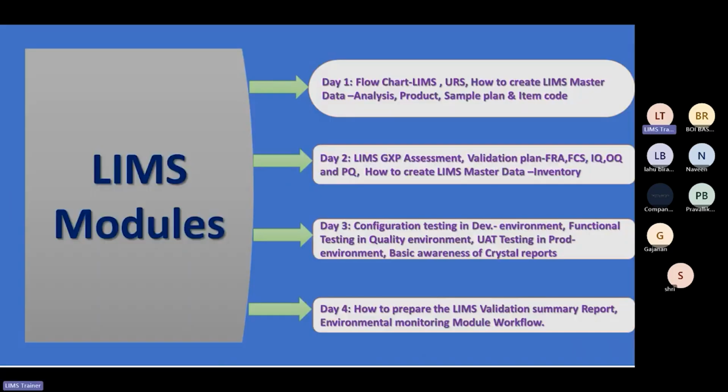Now see how we are going to take the course. See the flow chart, different flow charts involved in LIMS, then the user requirements, how to create master data for analysis, master data for products, master data for sample plan, item code, that we are going to see in detail. Then LIMS GXP assessment, validation plan, IQ, OQ, PQ, then master data, inventory, all the things we will see in detail.